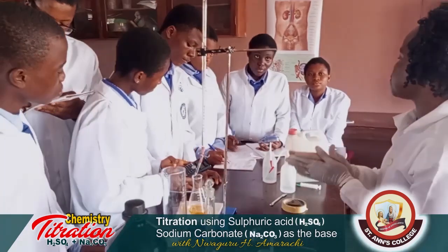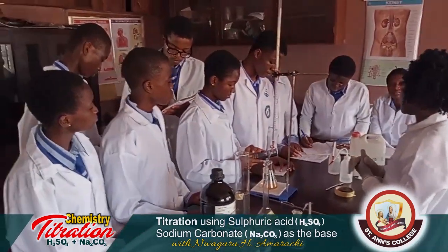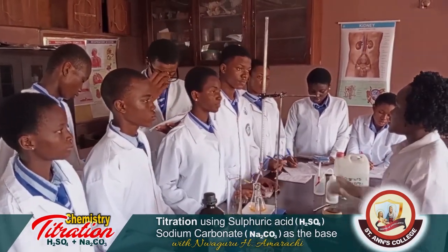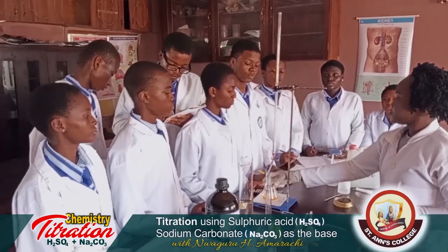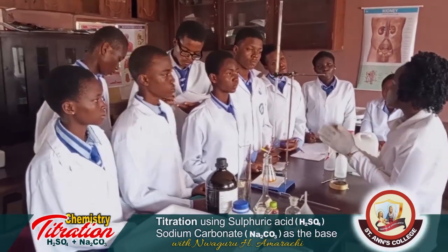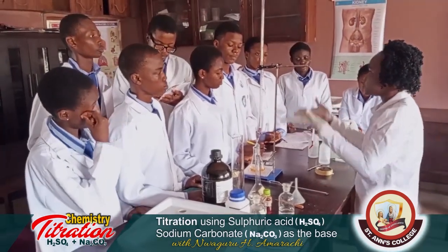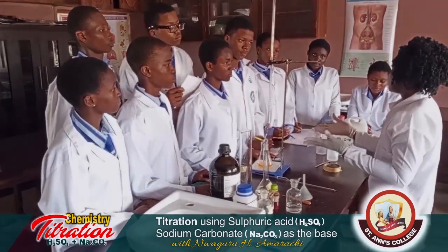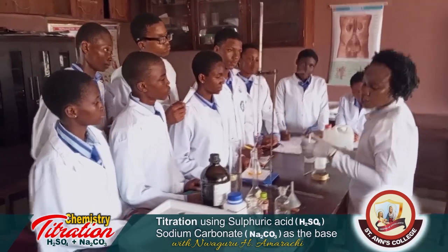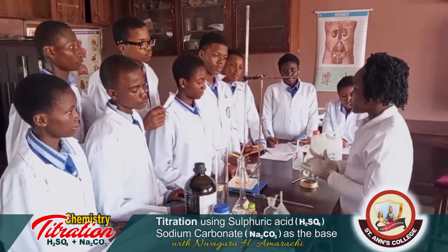That's our average volume of acid used. And remember, it must be in cm cubed. The reason is that these are what we know as volume. They are in liquid form, so they are in volume. When it's in solid form, we call it gram. But if it's in liquid state, it is in volume, and you use some apparatus to measure the quantity. But if it's in a solid state, it's measured in gram.